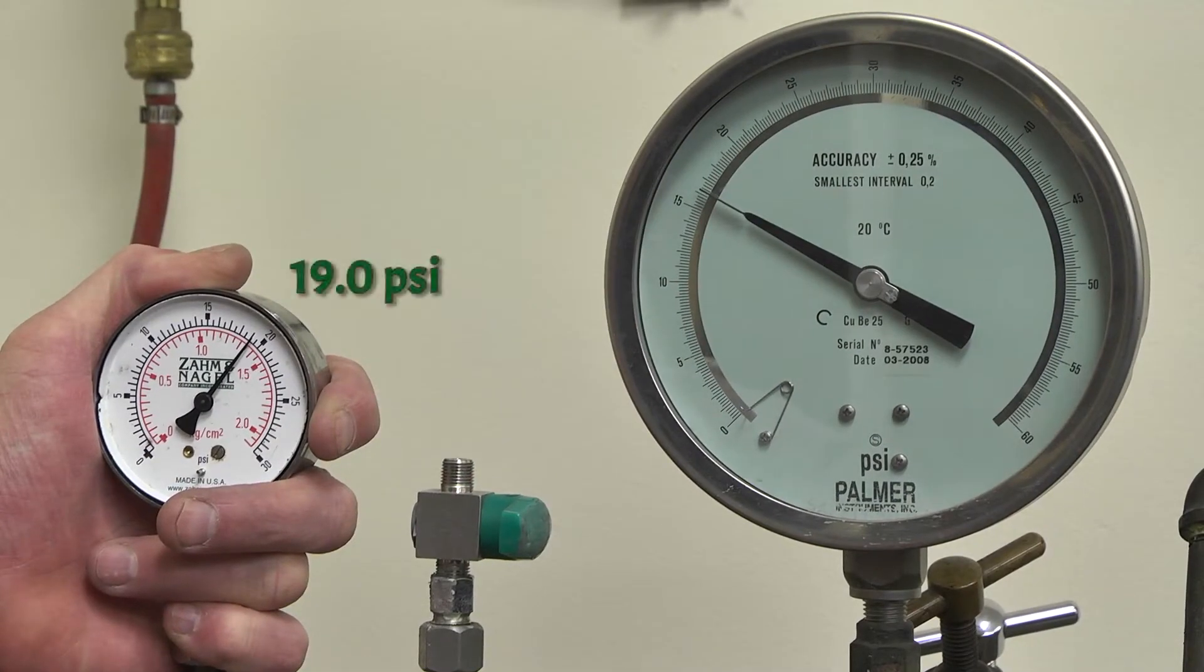Compare readings on the subject gauge to the gauge tester. If the reading varies more than one quarter of a PSI, you can adjust the subject gauge.